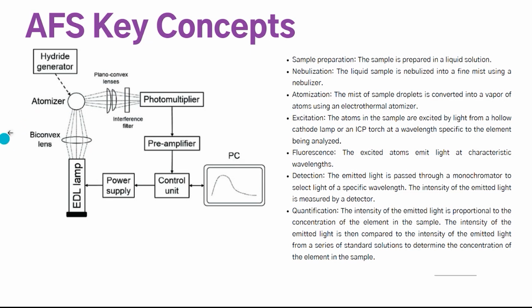So that is a principle of atomic fluorescence spectroscopy. All right. So after this step, the emitted light is then detected and recorded.